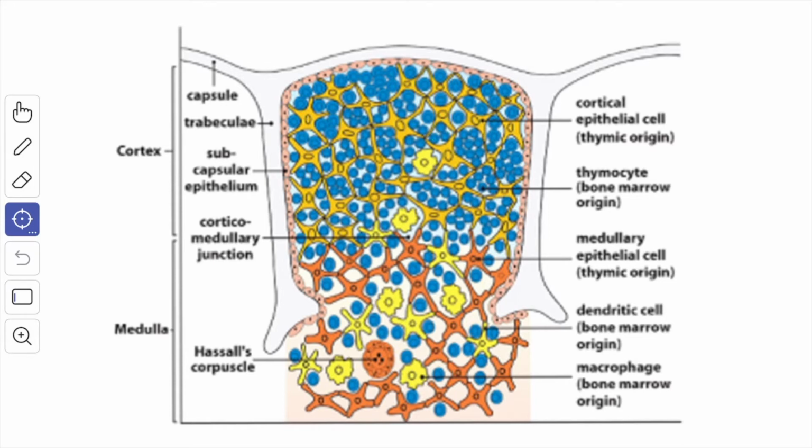The lymphatic nodules are not present in the normal thymus. The medulla of each lobule also contains lymphocytes, but they are less densely packed than in the cortex. As a result, the epithelial reticulum is more obvious in the medulla than in the cortex. As thymocytes divide, they pass deep into the cortex and into the medulla. Ultimately, they leave the thymus by passing into the blood vessels and the lymphatics.